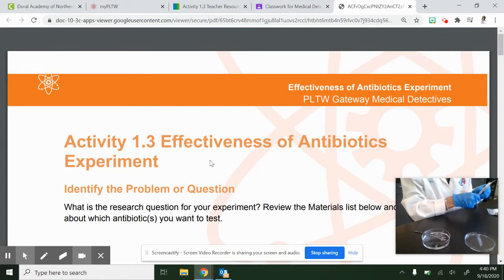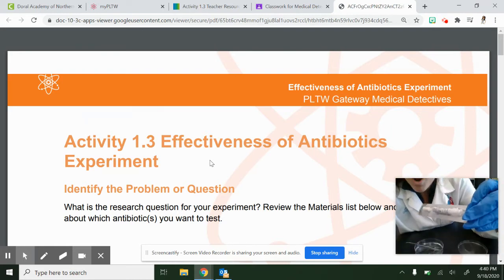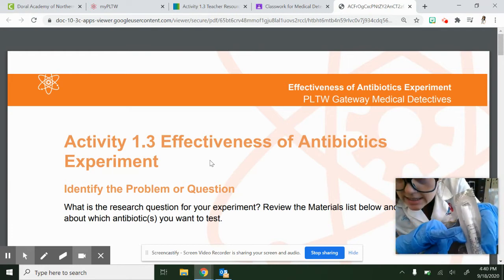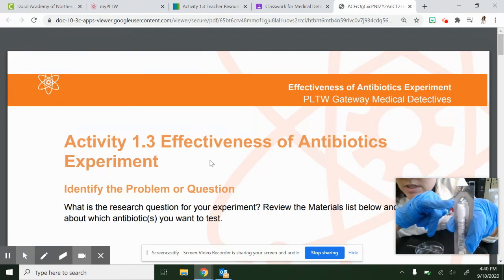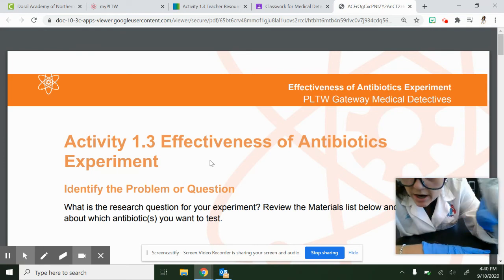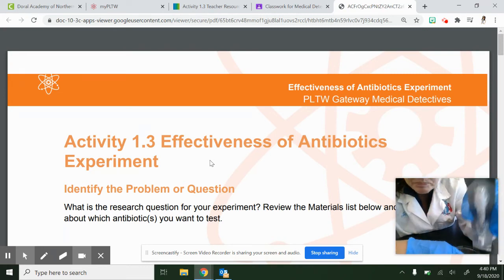So then when I come over to you, I'll bring, I don't want to open these yet because I don't want them to have air to them. So when you call me over, I'm just trying to show you, there's these little tiny discs, okay? And using your sterile tweezers, you're just going to grab one of those discs and then you're going to put it into your lid. So you'll just set it into your lid. So you're going to grab one of these little tiny discs here. I don't know, you probably can't really see it on here, but anyways, it's tiny. It's just a little circular disc, okay? And then set it onto the lid.